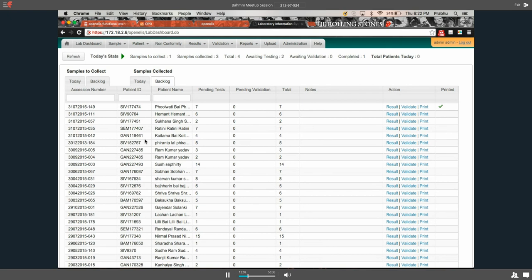And so we actually have a warning to the lab at the moment when a test hasn't been completed, where the sample has been taken but the test not completed within 3 hours. So that's why I was wondering whether that ordering is by the time, or at least whether you can see how long they've been in the queue. It's something that would be important for us.